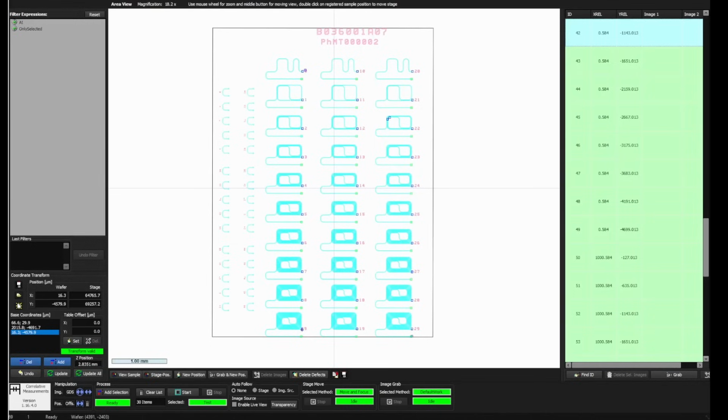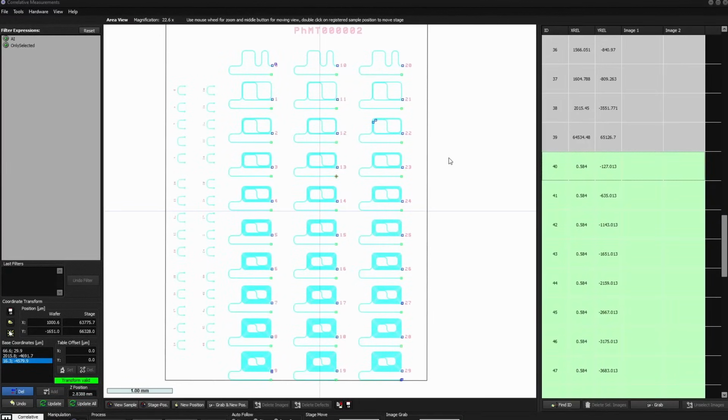Previously, it was harder to teach this workflow as one had to take care that the beam shift is reset before moving to the target areas of the different positions. Let me show you now how to create the workflow.